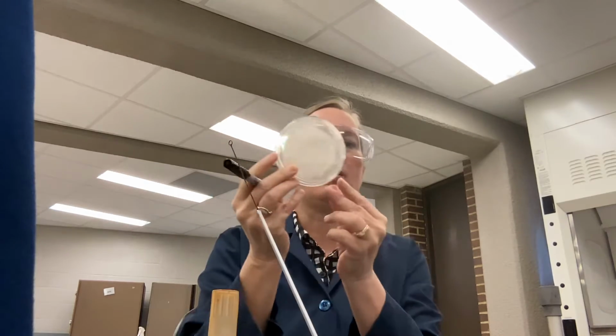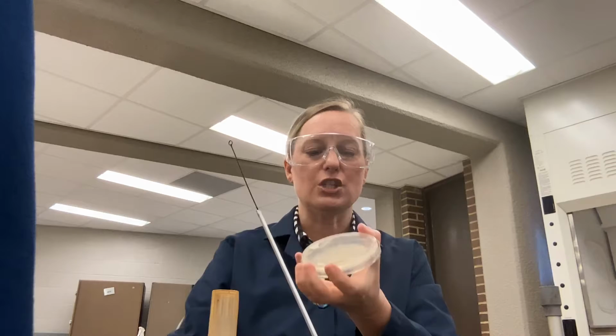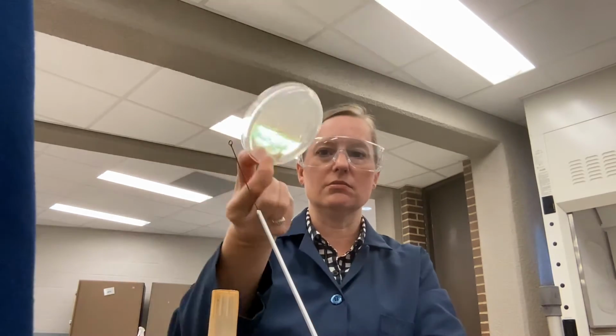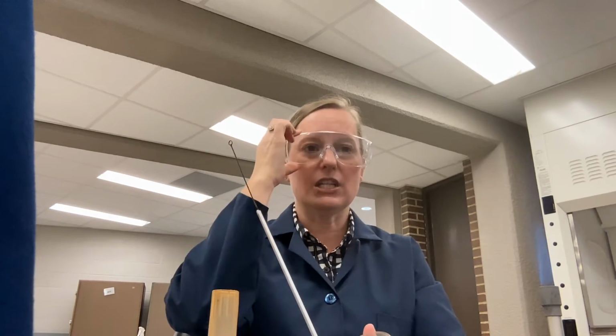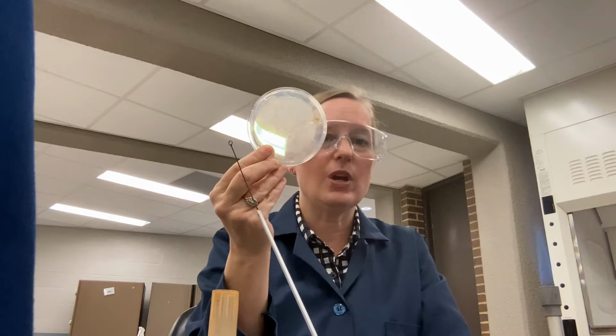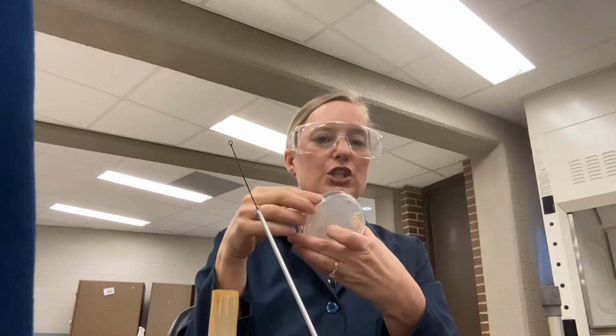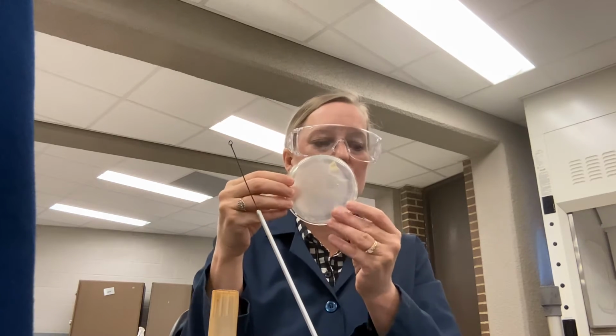We're going to begin with what's called a nutrient agar plate. It's just a petri dish with agar, so it's upside down, okay? And agar is kind of like a gelatin type material. And we're going to label our plate. We always label the bottom of our plates because the lids come off, and we want to make sure that we don't get anything confused.